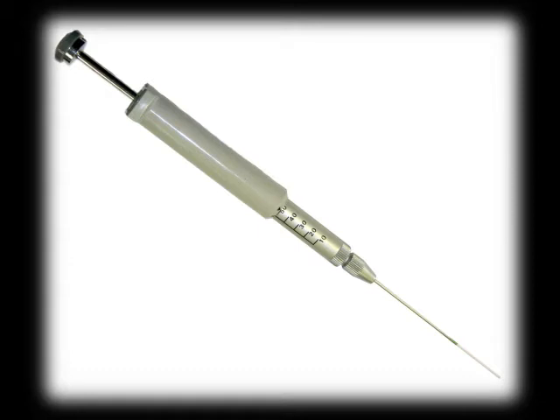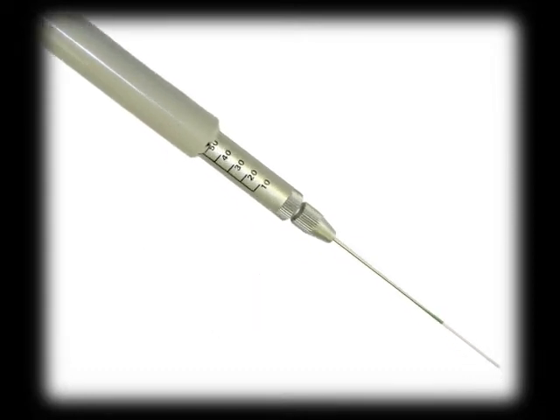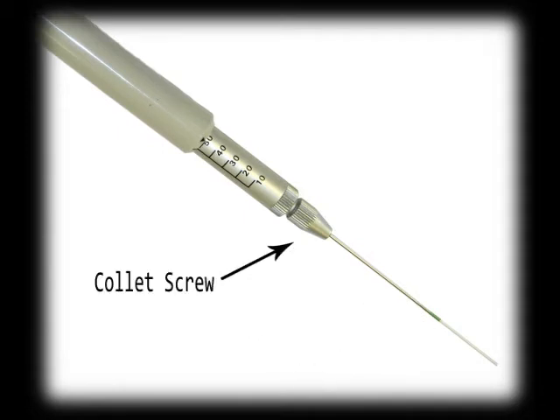A micropipette has several parts: a handle, a movable barrel with preset volumes, a plunger, a collet screw, and a capillary tube.